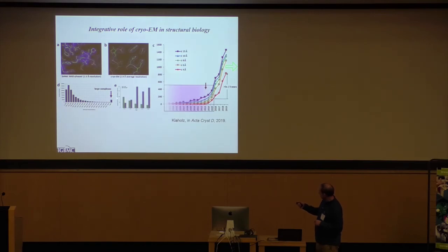When you look at large complexes, they are all here. So most of this is actually around 40 kD crystallography, and these ones are all cryo-EM based. And clearly there's a shift, because now you see here the contribution of cryo-EM and crystallography to the PDB has just changed. So this is 2016 about that, and you see how this now contributes to high resolution data as well.